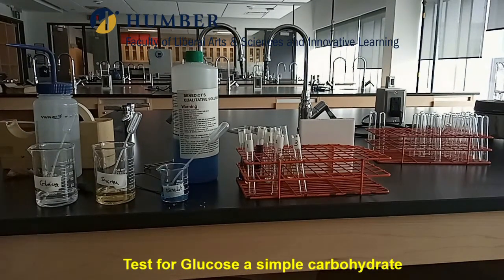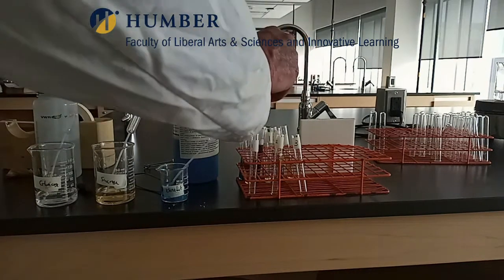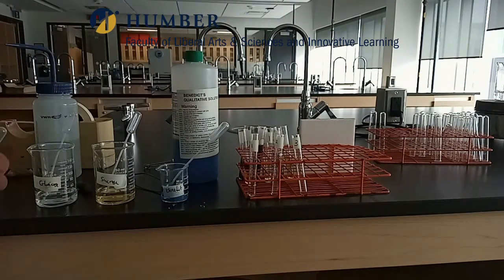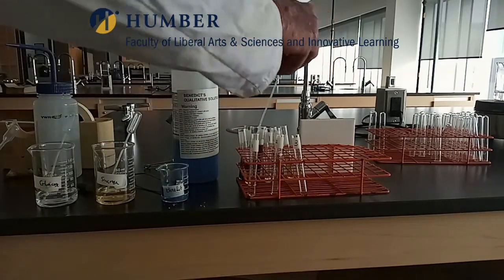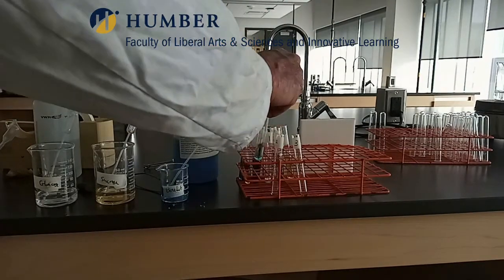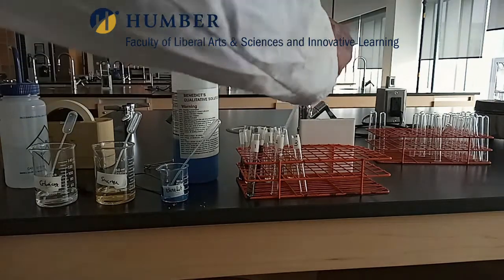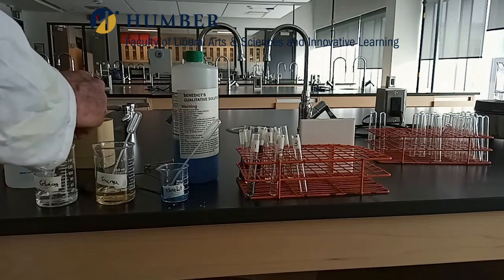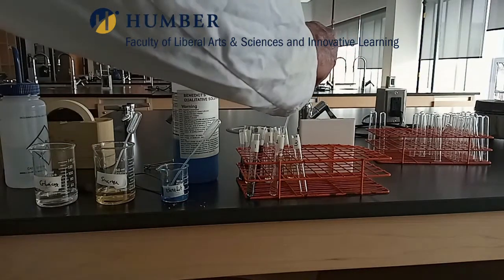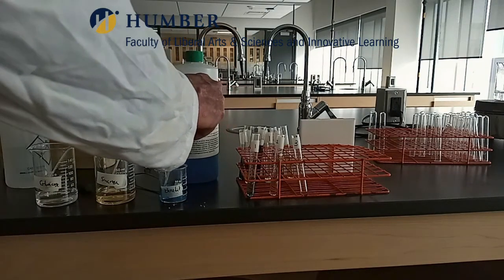We're going to add 2 mL of water in test tube 1, and add 1 mL of Benedict's solution. Add 2 mL of distilled water to test tube 2. We will add 2 mL of glucose solution, and 1 mL of Benedict's solution.